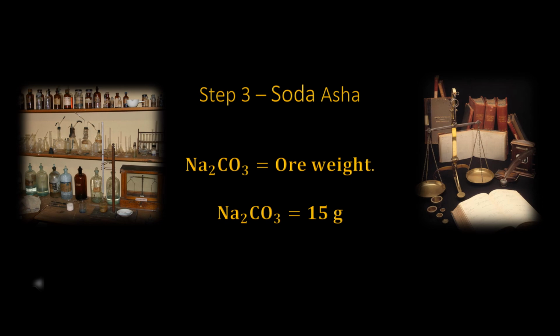Step 3 is the same as that used for the Class 2 ore types. It is the simplest of all calculations. The amount of sodium carbonate that is used will be equal to the weight of the sample. In this case example, it will be 15 grams.